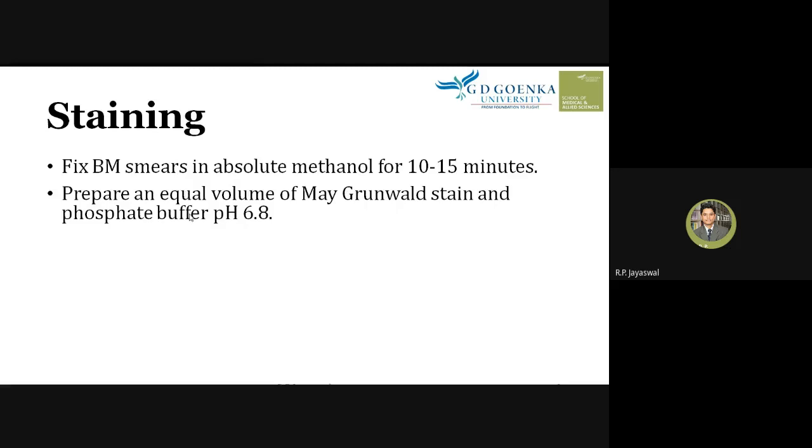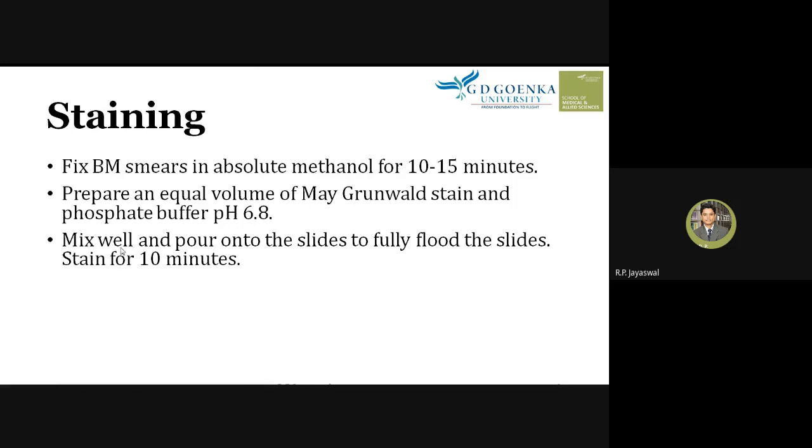Why are we preparing the mixture of this phosphate buffer and May Grunwald stain? The purpose is that when we use the phosphate buffer of 6.8, the stain pH can be maintained at 6.8, so that the proper staining reaction takes place. Then mix well.